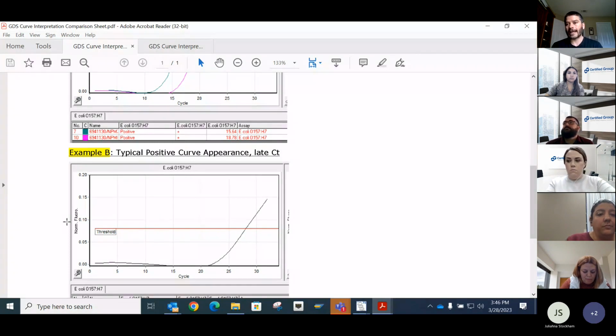What we don't see is the raw data gathering that's actually occurring. As that data comes in, if the fluorescent level in that reading was just different than the previous ones, it can cause that line to move. But then the next reading, it levels out. So it's just a little bit of difference in the fluorescence reading in that cycle that caused that line to float in a different fashion, and then as more data is collected and analyzed, that line will level out. Thank you, Rodney. You're welcome.